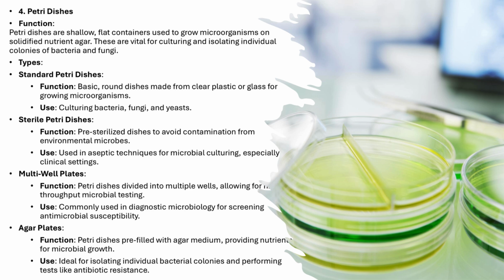Sterile Petri dishes. Sterile Petri dishes are pre-sterilized to avoid contamination from environmental microbes. These are especially important in aseptic techniques, where avoiding contamination is key, particularly in clinical settings or when handling sensitive samples. Multi-well plates. Multi-well plates are essentially Petri dishes divided into smaller compartments or wells. These are used for high-throughput testing and are commonly found in diagnostic microbiology. They allow researchers to test antimicrobial susceptibility or perform screening tests on multiple samples at once.